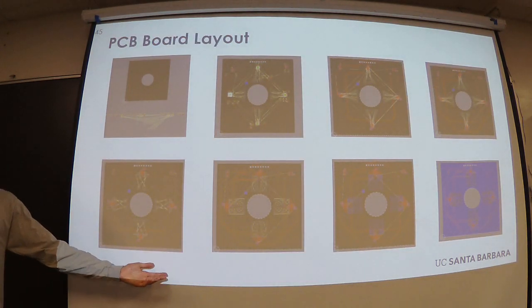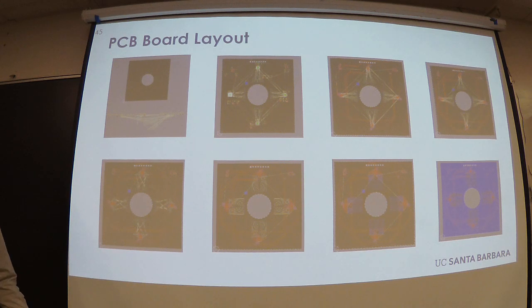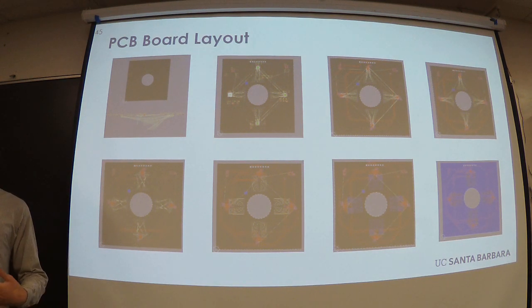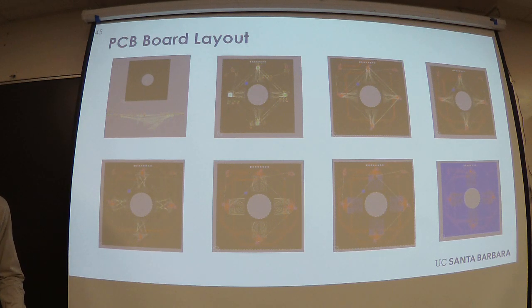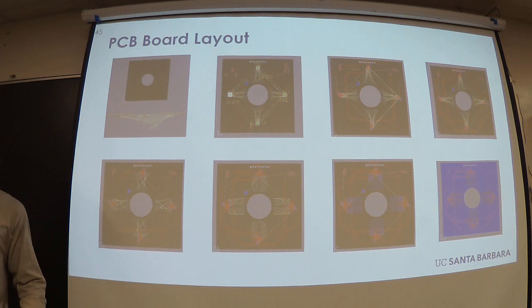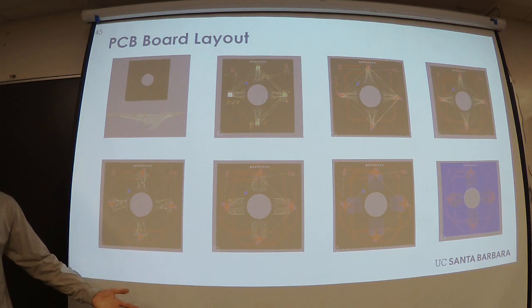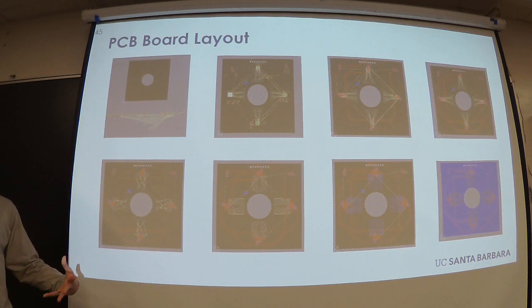So I got to work designing. I picked all of the electronics that were going to go onto this PCB. I drew up a nice schematic. I laid out the board in Altium. And this is a nice progression from laying out the board to finished project. You know, this is a very nice picture, and it might look very simple, but this is actually a good chunk of time invested to take it from nothing to this final project.